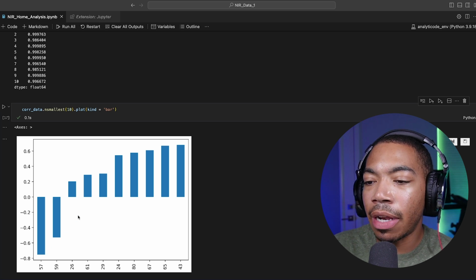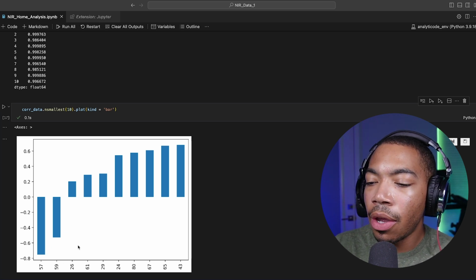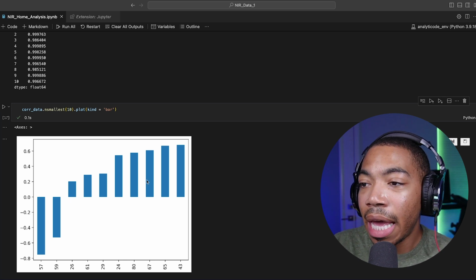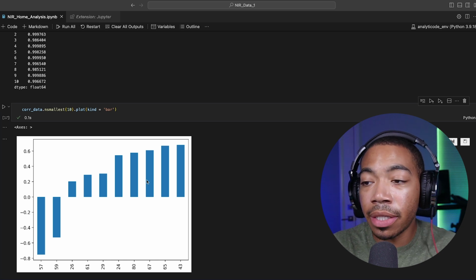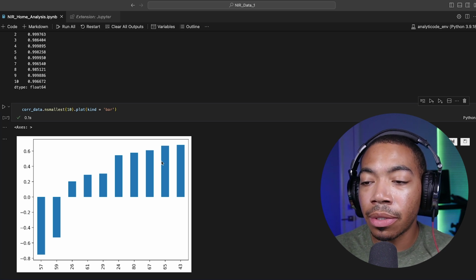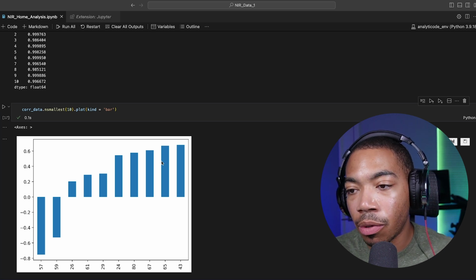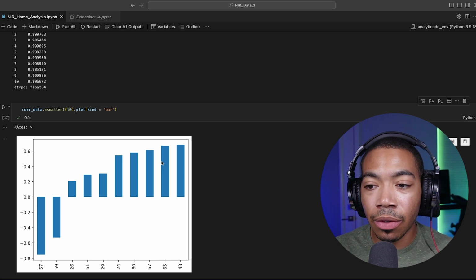And we can see that even as we move across, these are the sample IDs, 57, 59, 26. We have data that's either anti-correlated or very weakly correlated. And this is how we can begin assessing measurement quality. So this is a key intuition and perhaps helps us to design better studies or clean up our data by removing these samples that, even based on the replicates, are not highly reproducible in this case. And so next, let's dig into these samples so we can try to understand why this was the case.